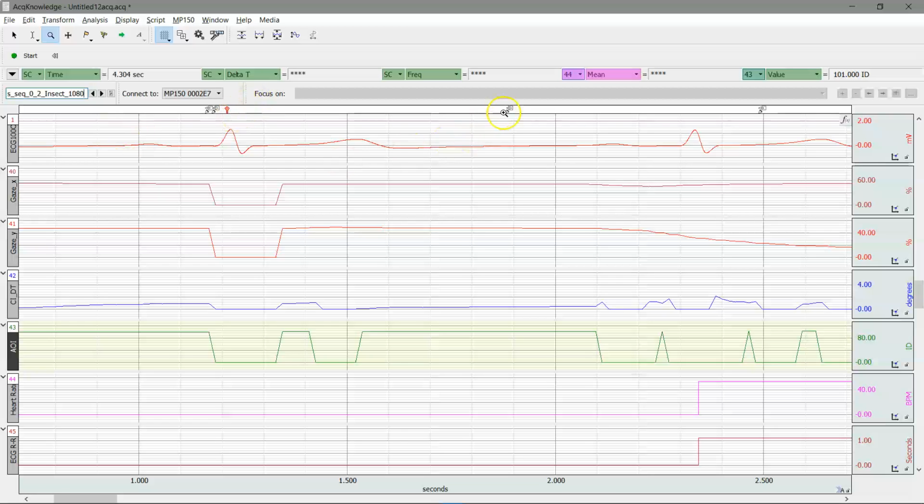And then to the right of that over here, we then have the area of interest information. So this is an area of interest hit, and you can see the label on there. The ID is 100 insect. I chose the friendly label insect, but the internal ID is 100, and that relates to this green channel down here. So that information comes across each time.